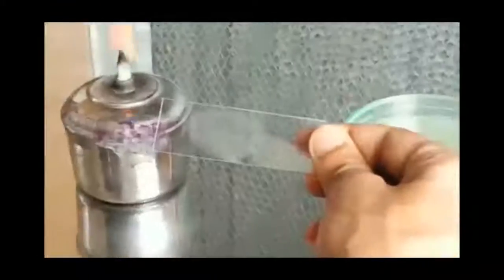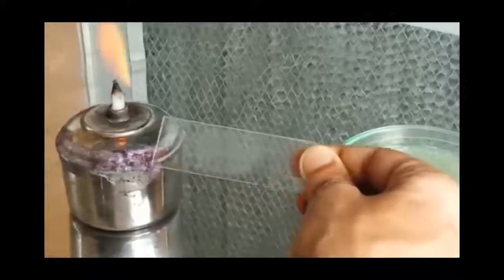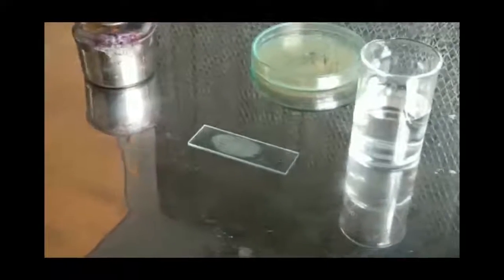So in order to heat fix a bacterial smear, it is necessary to first let the bacterial sample air dry properly. Then we allow the slide to be passed through the flame.